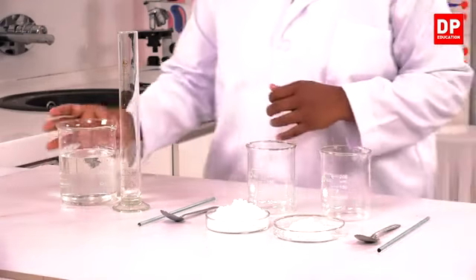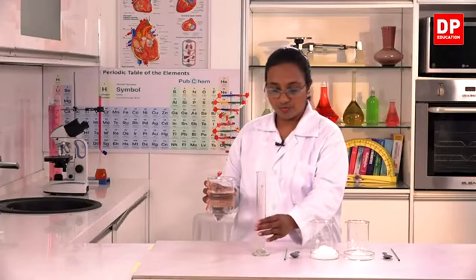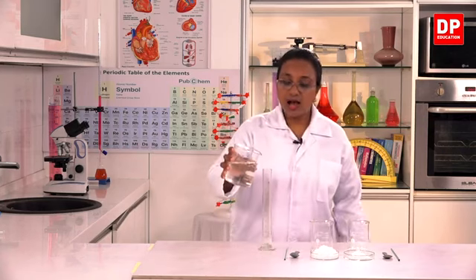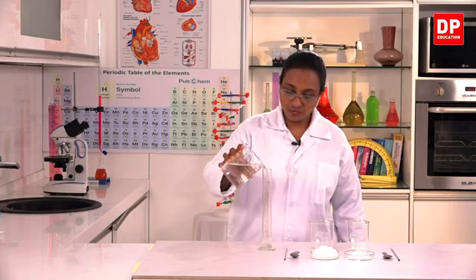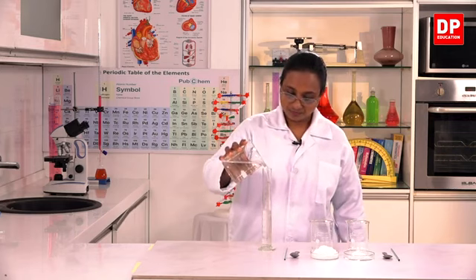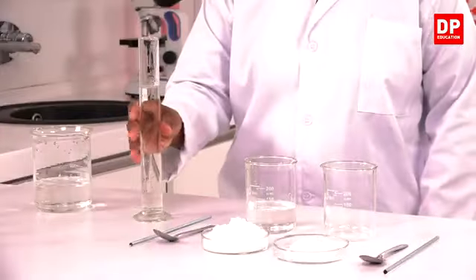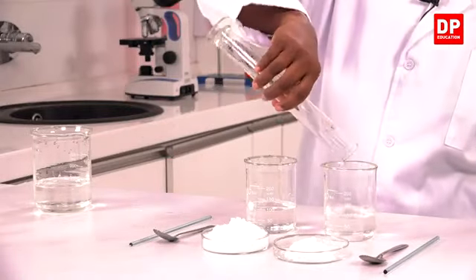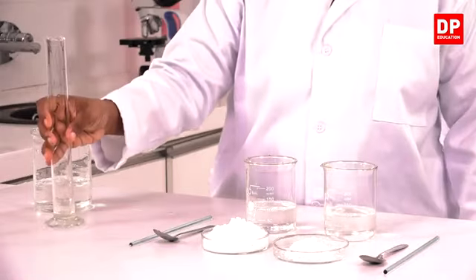So first I'll take equal volumes of water using the measuring cylinder. I can measure 100 centimeter cubes of water. Okay, so I have the 100 centimeter cubes of water in both beakers.